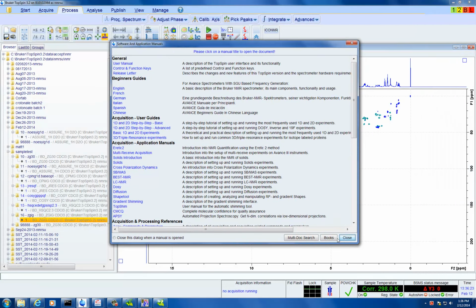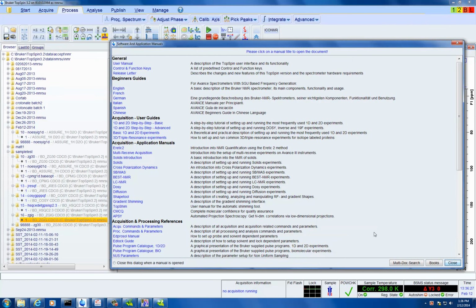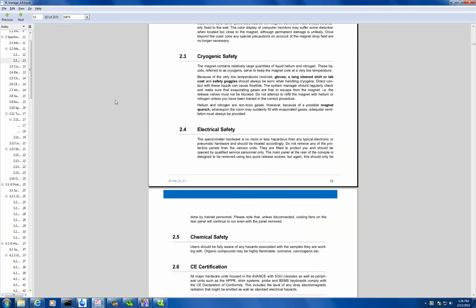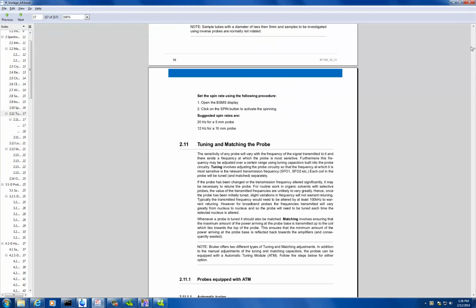since it's almost very difficult to go through every feature in Topspin, so the manual is really where I start to learn. So if you want to know how to do certain 1D experiments, 2D experiments, all of them are here, which then really goes through, from obviously, the intricate basics of how things work.